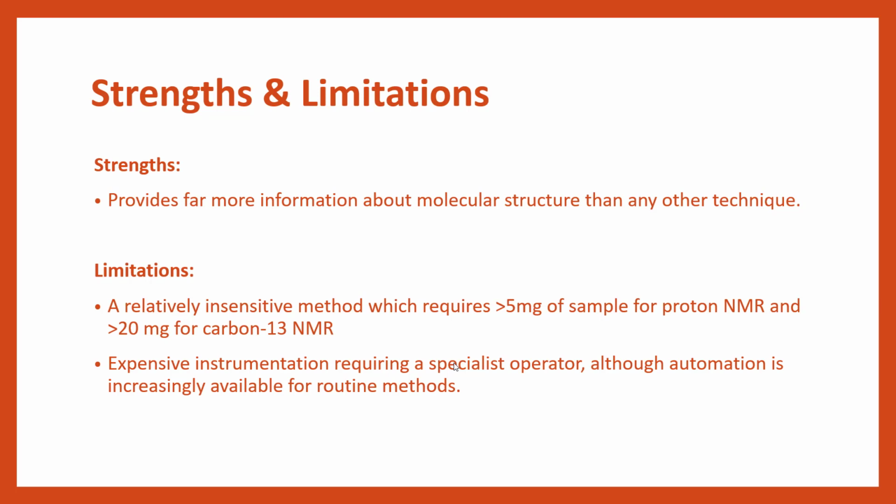So if you have a highly volatile solvent, something like acetone or something you can boil off, like methanol or ethanol or water, maybe, okay, you might be able to get it back out, but if you have something like DMSO, you may not be getting that compound back out.